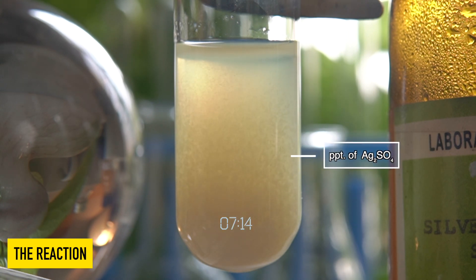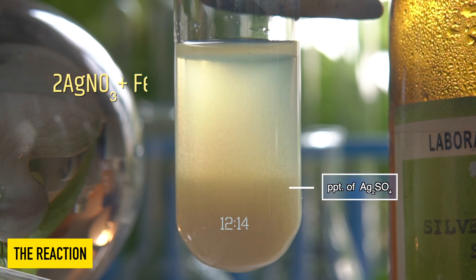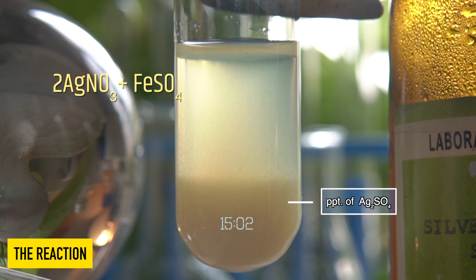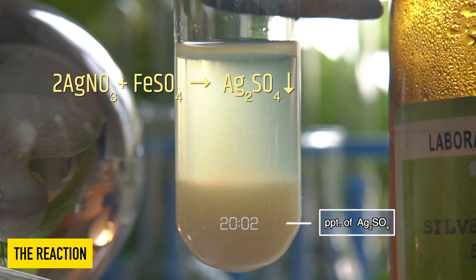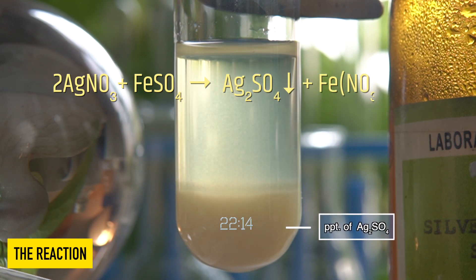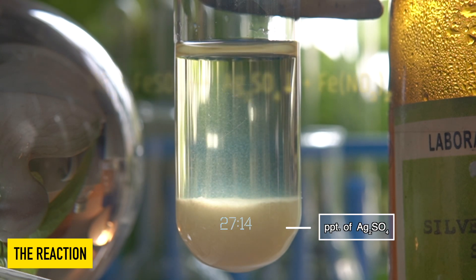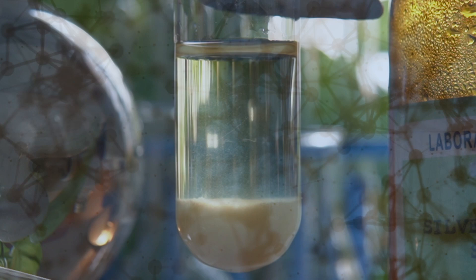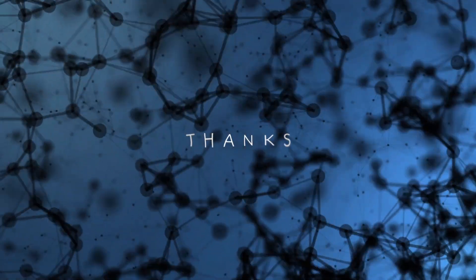So in this reaction, colourless silver nitrate solution reacts with iron 2 sulfate to produce a white insoluble precipitate of silver sulfate along with iron 2 nitrate.